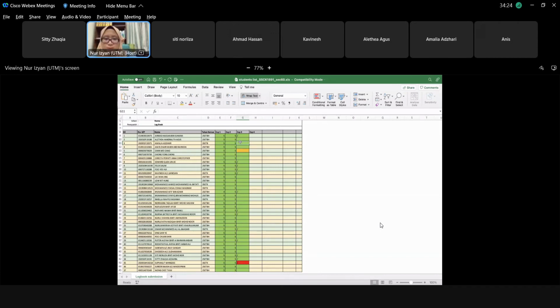By saying whether it is on the mark or not. Okay, so the correct way to do it is to make your eye level at the same level as the mark, isn't it? Okay, yes. Thank you, Amalia.